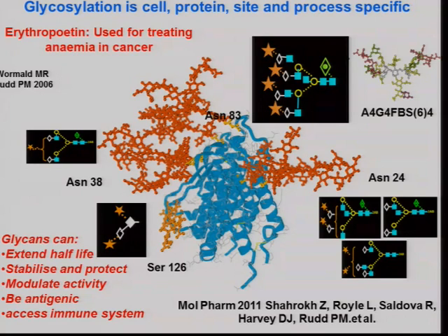So the mass spectrometrists always want to talk about absolute quantitation. And that is very difficult. I mean, how do you know your standard is accurately weighed? You don't know it's only sugars. I saw some data the other day where somebody thought they had 98% pure sugar, but it had 5% DNA in it because they hadn't looked for DNA. So knowing how much water there is when you weigh something out is in itself really challenging if you're talking about making accurate standards.